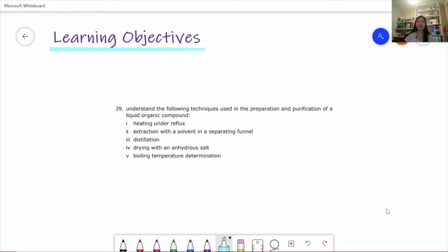Everyone, thank you so much for clicking onto the video. Today's learning objective is to understand the following techniques used in the preparation and purification of a liquid organic compound. So we're going to look at heating under reflux, extraction with a solvent in a separating funnel, distillation, drying with an anhydrous salt, and also boiling temperature determination.